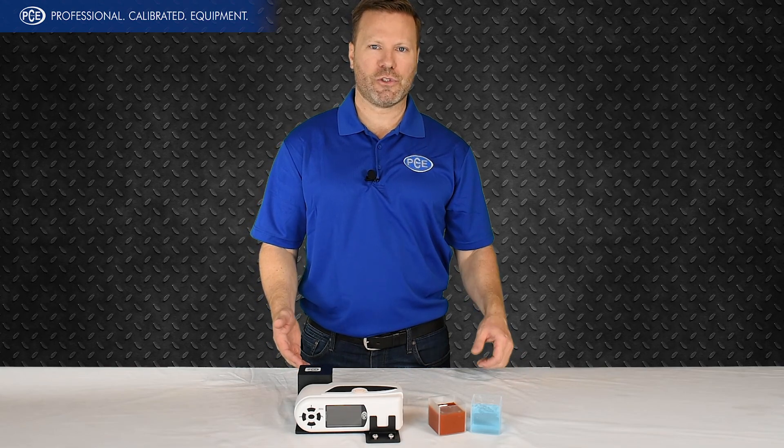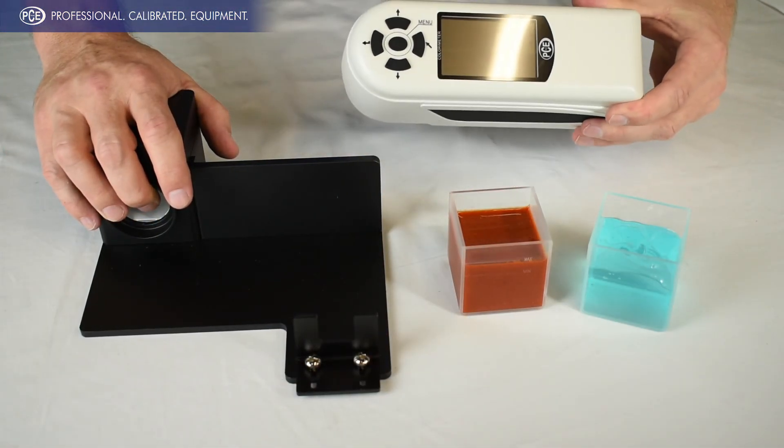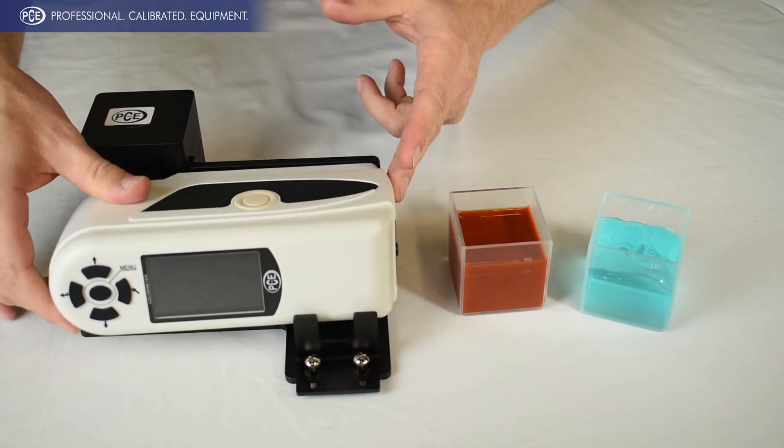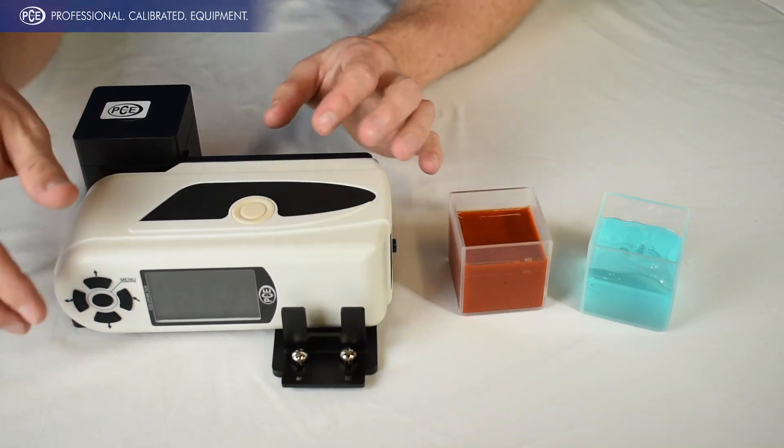Today we're gonna be doing a test on gel and a liquid. So we have the test kit right here. This is gonna be our CSM3 colorimeter. You basically just take the colorimeter and it fits right in here, and then you can kind of tighten it down with this little bracket.